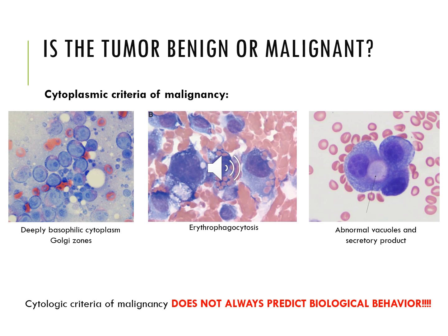This kind of eosinophilic inclusion in the cytoplasm is what's known as a Melamed-Wolinska body. You guys don't need to know the name. I barely need or know the name, and I need to know it for boards. But they're frequently seen in transitional cell carcinoma. So if we have a sample that we're concerned for and we see these, it's much higher on our list and much more likely. That's just something that I wanted to point out.